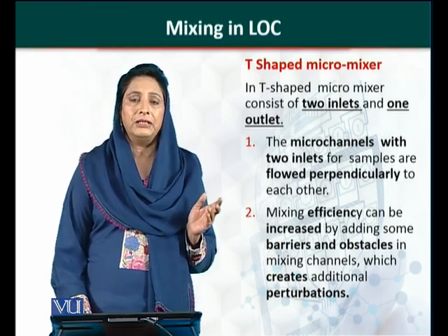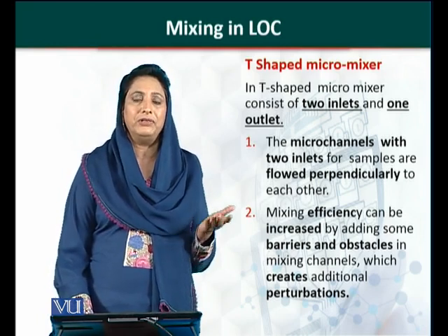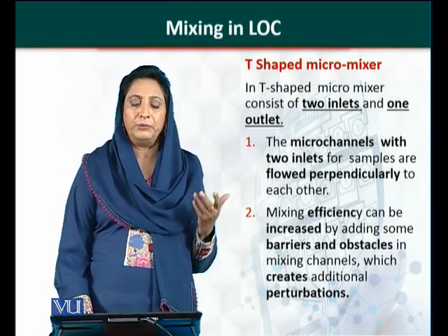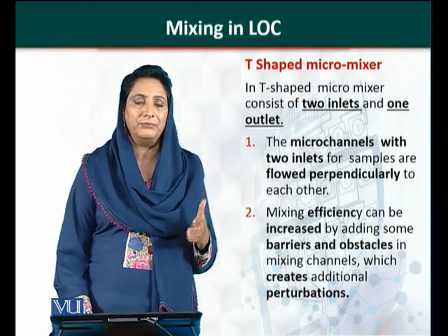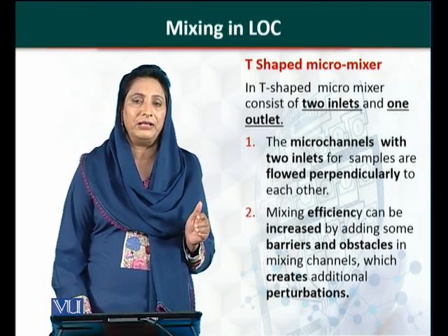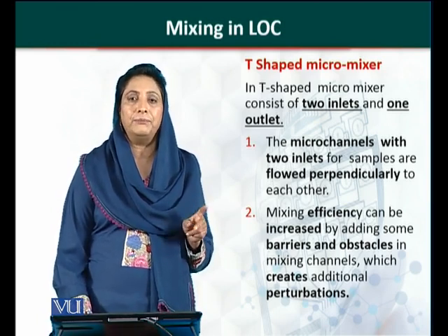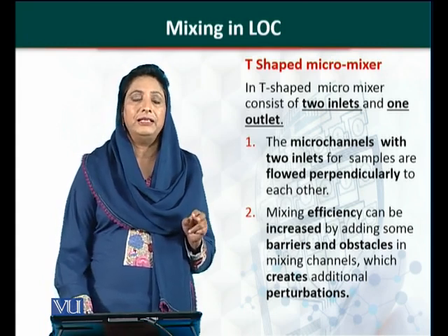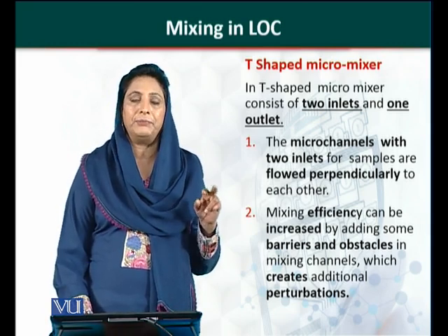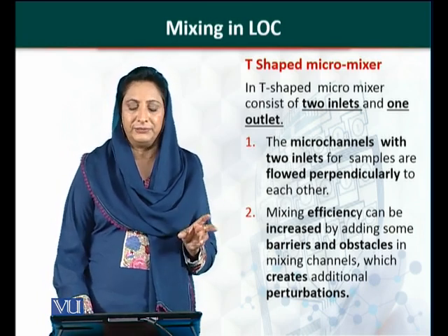इसमें मैं आपको एक एग्जांपल बताऊंगी जिसमें we can use a different geometry. For example, we can use a T-shaped माइक्रो मिक्सर और we can use a Y-shaped माइक्रो मिक्सर. आमतौर पे ये दो तरह के माइक्रो मिक्सर इस्तेमाल होते हैं, लेकिन मैं सिर्फ टी माइक्रो मिक्सर की यहाँ पे आपको एग्जांपल दूंगी. अगर आप टी शेप को जहन में इमेजिन करें तो there are 2 inlets and 1 outlet, यानी कि सैंपल दो जगह से एंटर हो सकता है and they can travel parallel to each other, or they can enter perpendicular to each other and then they can travel parallel to each other and later they can mix.